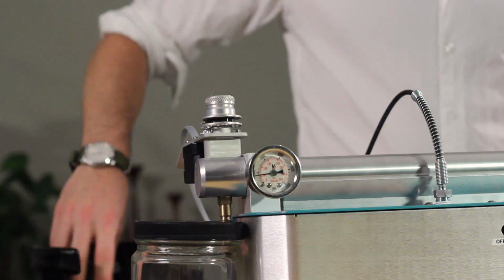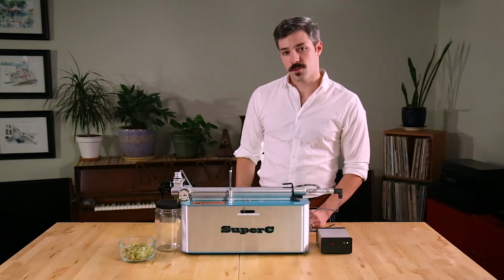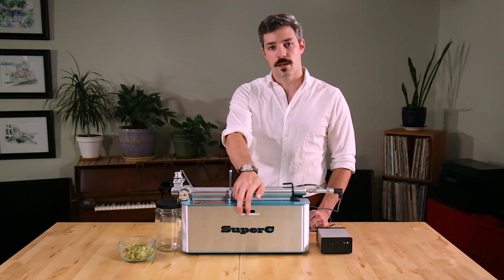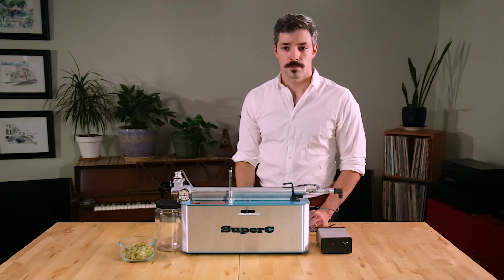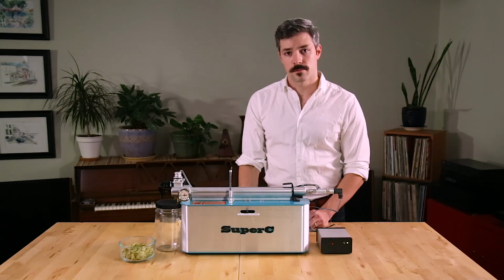That will give us an 800 psi bulk feed from the tank, from which we can then increase pressure. The best way to do this is to start by flipping the switch to the middle position and allow the heaters to start heating the chamber. The sound of the fan means you're getting power to both the fan and the heater.